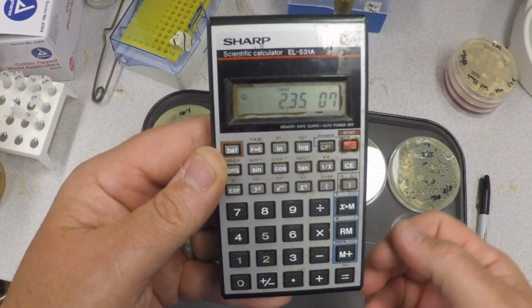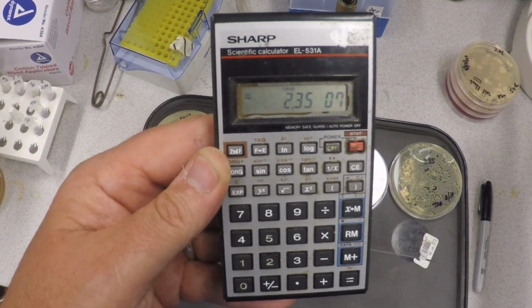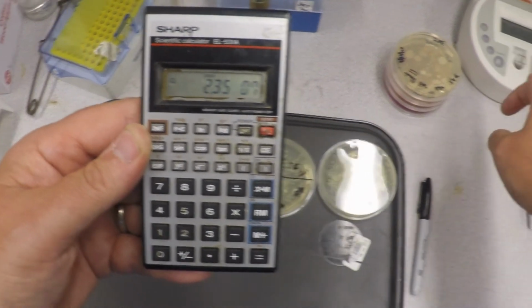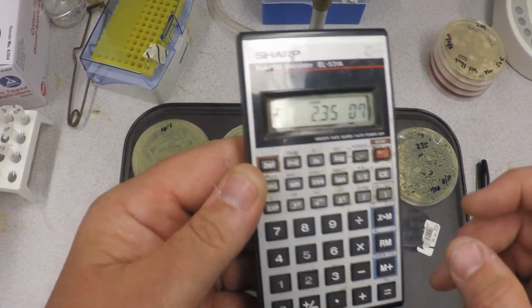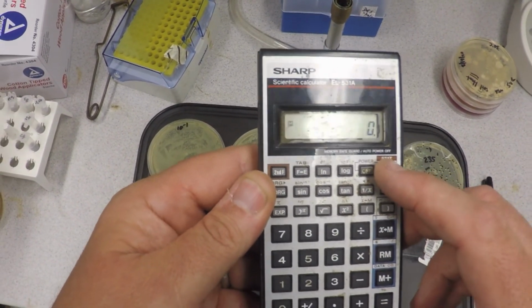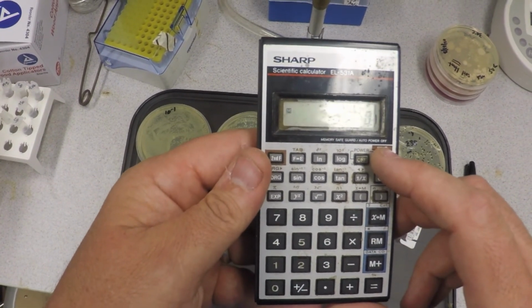That's wonderful. Now, when we did our absorbance reading on the spec over here, we got like 1.17 or something like that. I can't remember. And we said that one absorbance unit was 10 to the 9th.